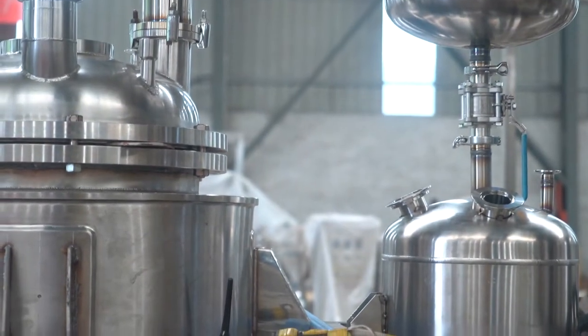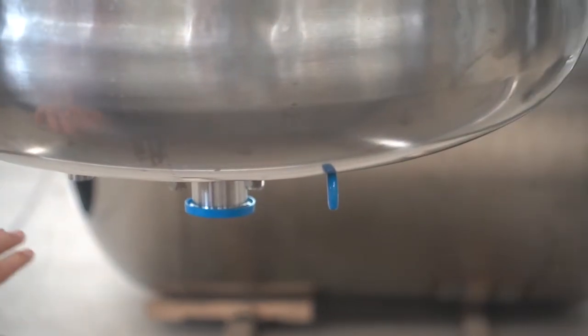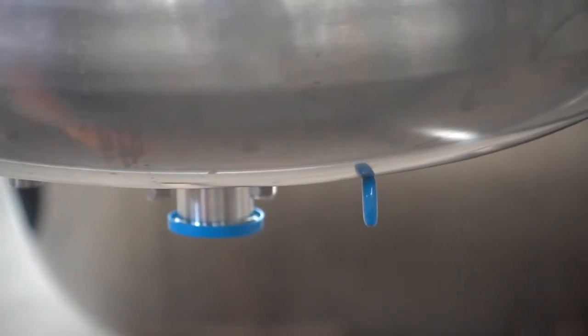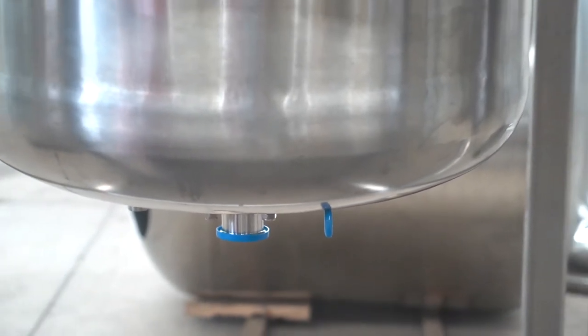At the bottom of the reactor, we will design a filter funnel put here. With the bottom wheels, you can move it very easily.